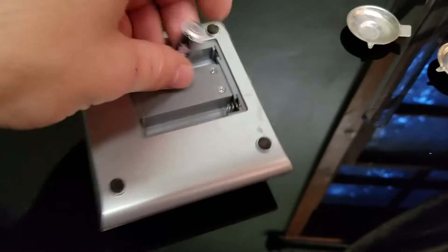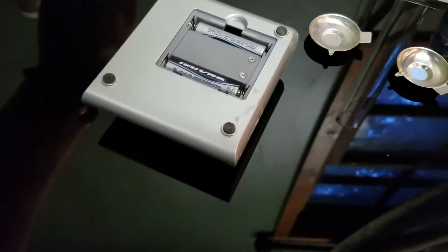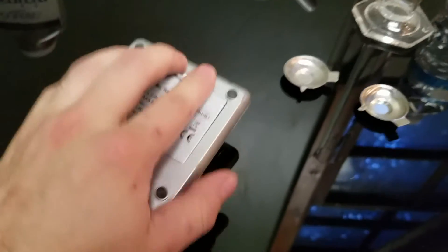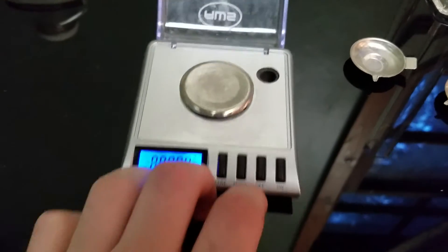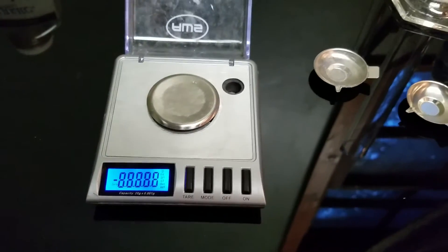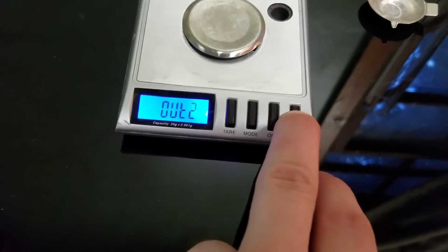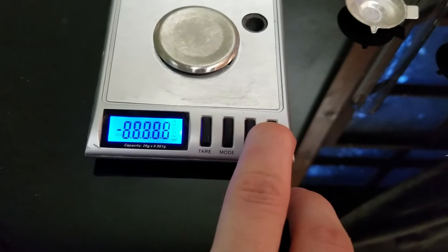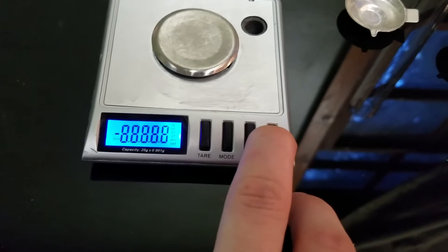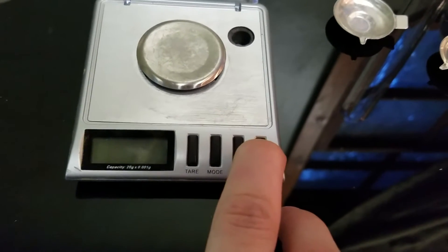I've used this one on a few occasions to test out. Although I was assured by many friends at my university that these are terrible scales, I thought an educational video to inform people that these are pretty dangerous would be good, considering how popular they are. I feel like every head shop sells one.